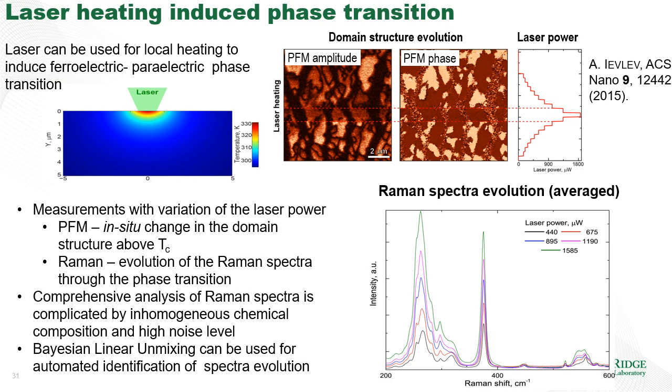So why is it a problem? It's a problem because it's relatively easy for us to get this Raman spectra, but it is very difficult for us to figure out what this even means, because you can see that on increasing the laser power, the spectra change in a systematic fashion, but they still remain very complicated and we sort of don't know what they represent. We cannot ascribe the intensity or shape of the peak to some specific composition.